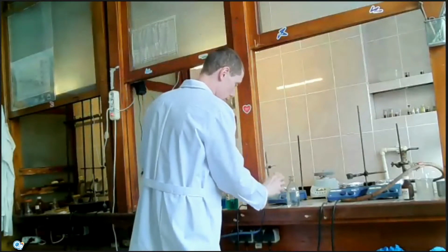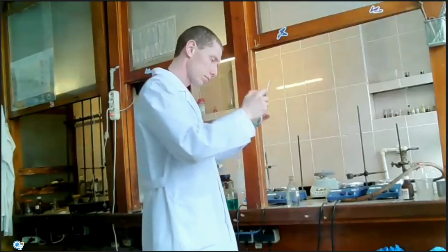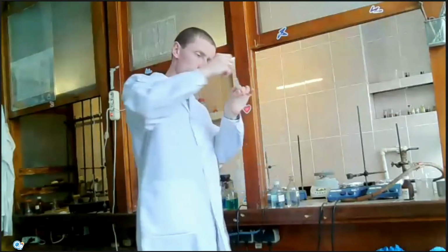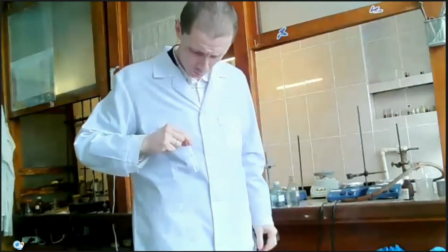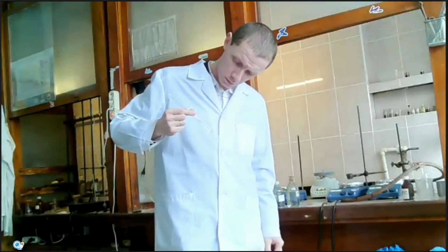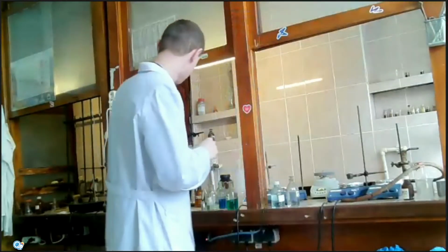Maybe I should add more ammonia solution. Now it's a clear solution without color and precipitate.